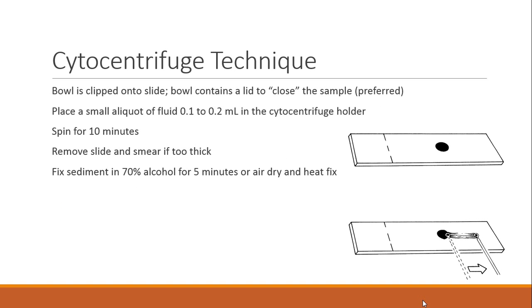A little cup kind of like this, and it's got a tube connecting from it, and then your little filter is here. So you put your drops of your sample in here, and when you centrifuge it, it pushes it out this way through the filter, and you have a slide right there. So it concentrates it right here on the slide. That way the probability of seeing an organism is much better.